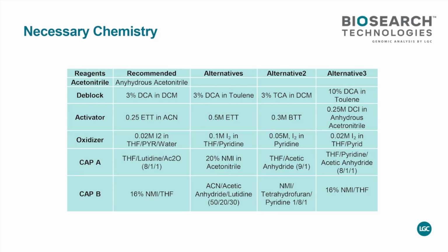However, you have to be careful with it because acid is extremely strong and it affects each base differently. If you use a really high percent for your DNA, for example, you will see a lot of depurination and deamination on your bases, hence creating mutations further down.